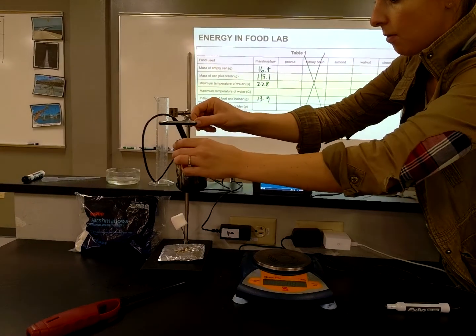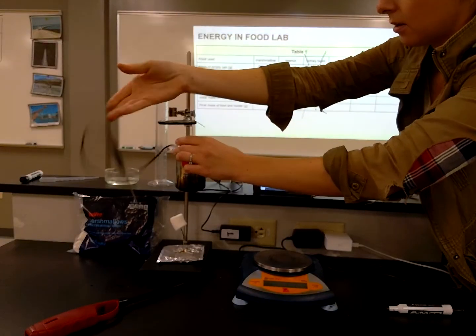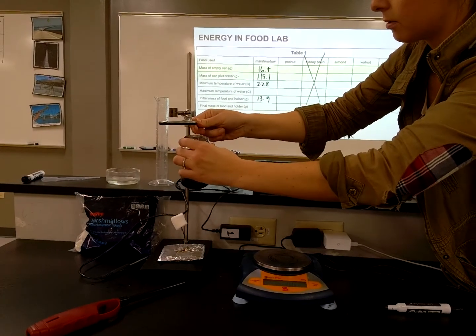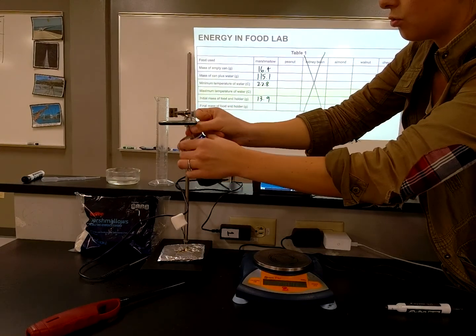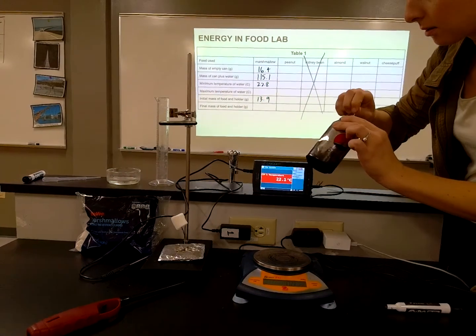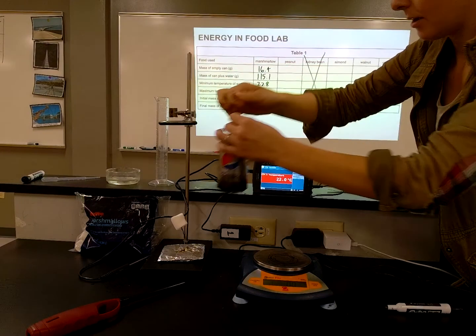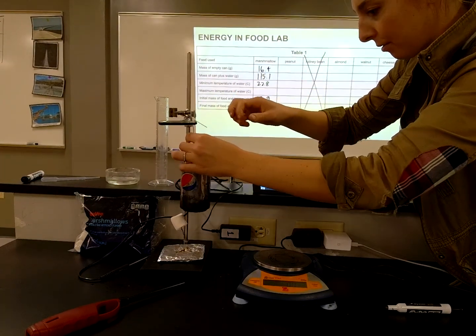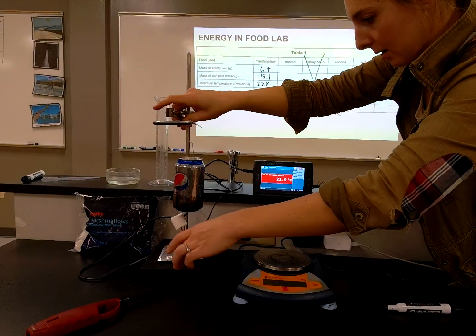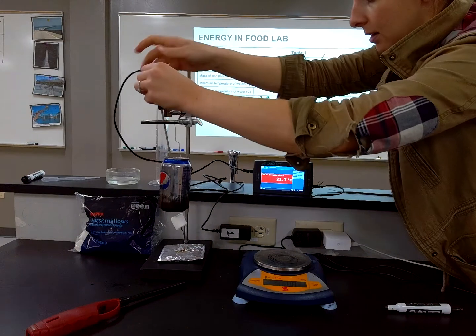Now, I want this to be a bit closer. There we go. We want that to be closer to the food so we can pick up a lot of that heat.